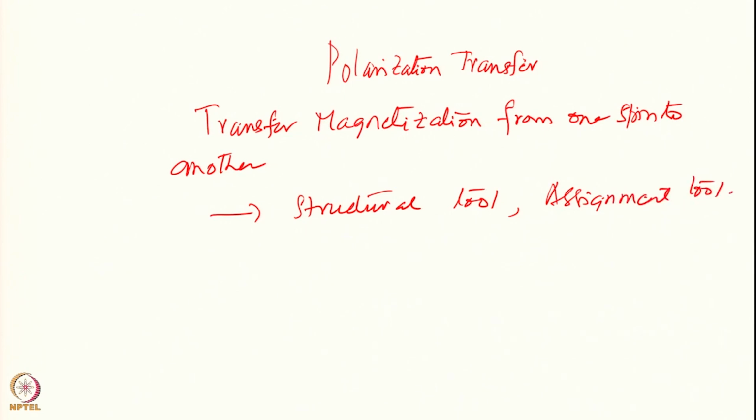Among these there is one important thing which is called NOE, the nuclear Overhauser effect. Okay. Now what is NOE?